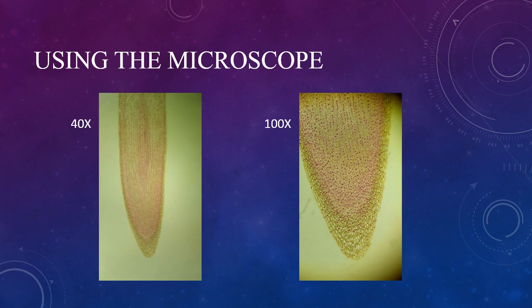Here we are looking at an onion root tip. Say the question we need to answer requires us to find examples of the different phases of mitosis. I would start by finding the tip of the onion root on the slide, then magnify until I could see the phases within the cells.